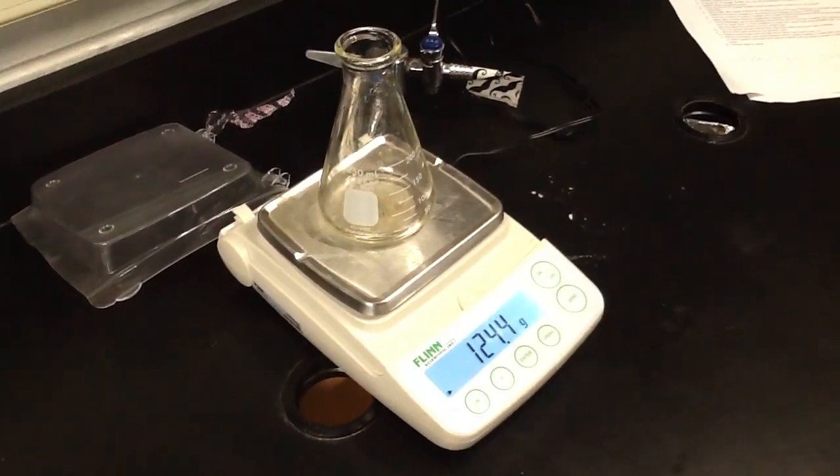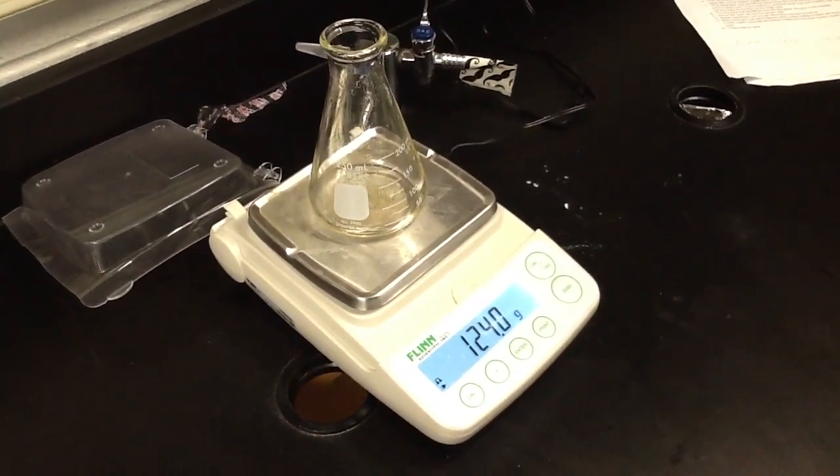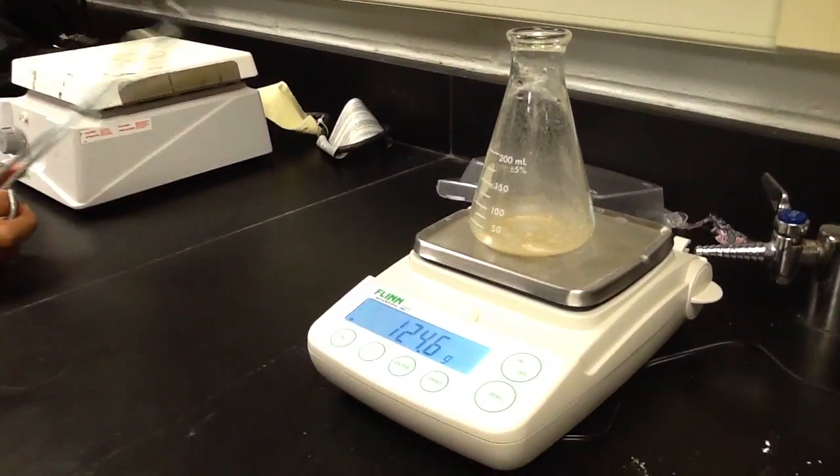To weigh the substance, you can just take the flask that has the product in it and place it over the digital scale, and you will get a weight.